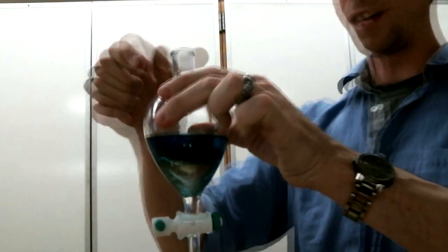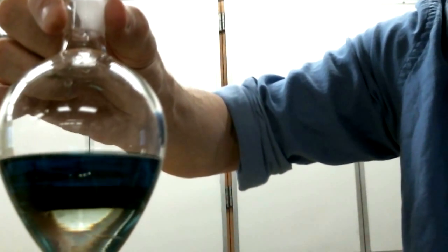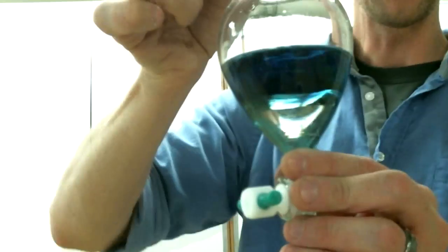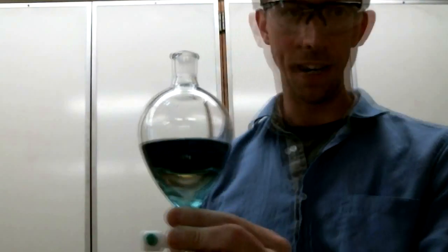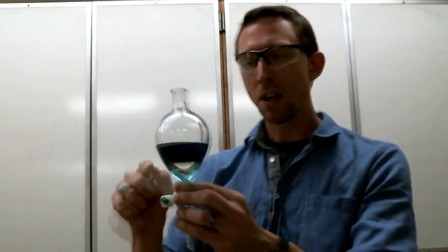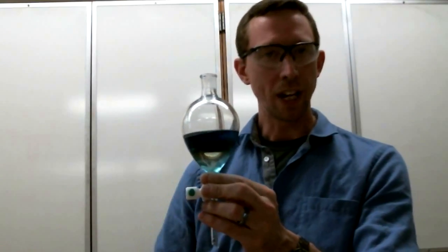Okay, so here it is. Before the actual extraction procedure has taken place, you can see I've got my blue dye and my N-butanol and my pure deionized water beneath. Now, the dye molecules really don't want to be here in the N-butanol. They really want to be down here in the deionized water. They're more soluble in that solvent. But right now, I haven't given them a way to get there yet, because they only have this thin little interface between the two across which they can move.